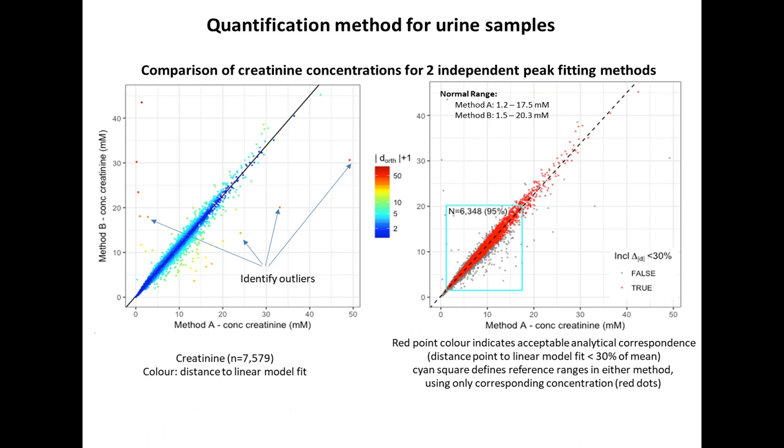Now switching to urine, and we're looking at exactly the same concept. How does quantitation of urine help us? Bruker have a nice quantitative fitting method for urine. Because the Bruker method is not published, it's obviously proprietary, we wanted to test it out against our own method. So Joran Posner, one of our postdocs, developed a method of curve fitting to quantify various metabolites, and we compared it with the Bruker.